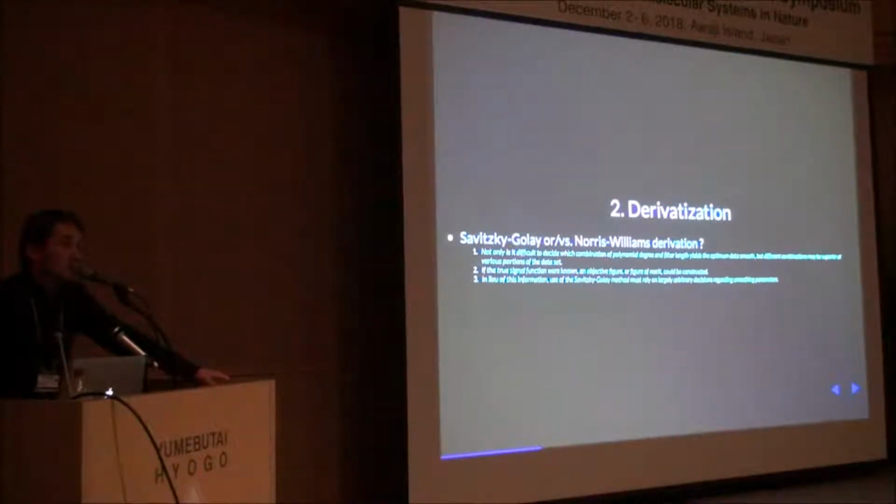The most common implementation of these tools is just a selection, not the perfect one, not the only one. The selection of parameters from Savitsky-Golay techniques that are easy to implement. There are many others, and another paper that is included has shown that there are ways to get around this and to make even better derivatives and smoothing transforms that better fit the data. So again, a lot of room for improvement.